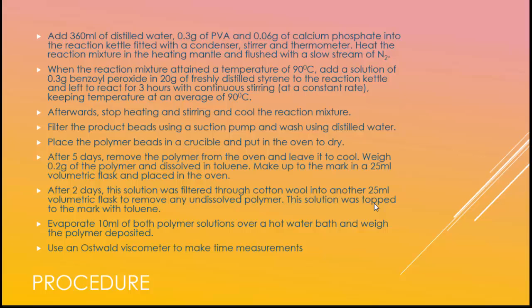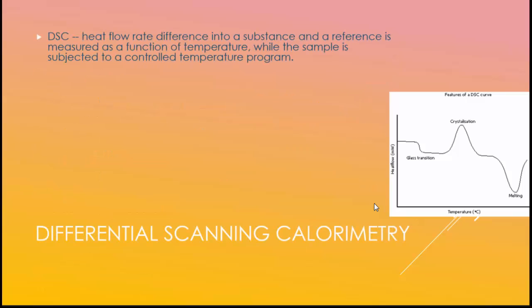And after that, you get to employ this Ostwald viscometer to make time measurements. Okay. Some of you may be new to this equipment called DSC, so I'm going to give you a short and brief introduction about it.